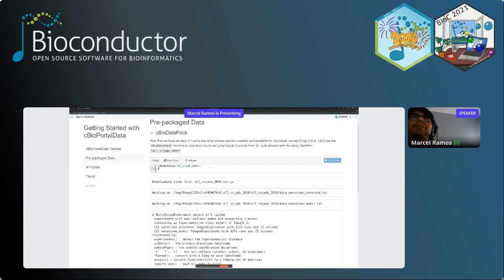So if you have a very important data set that you want to look into, we can help you make it work with the functionality that we provide. You can open up an issue on our GitHub page. It should be listed in our description file, under the BugReports field.